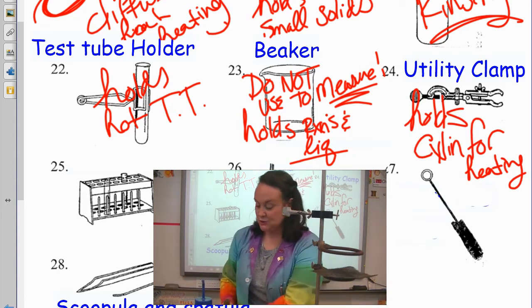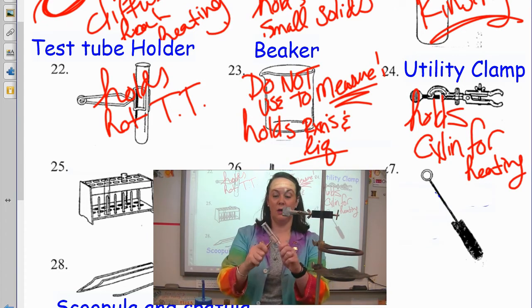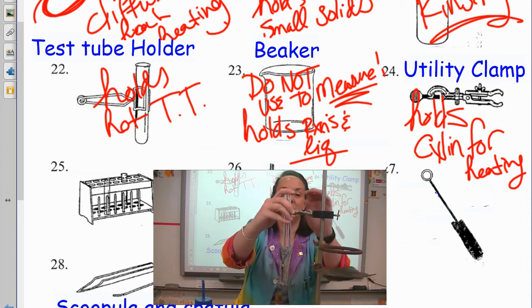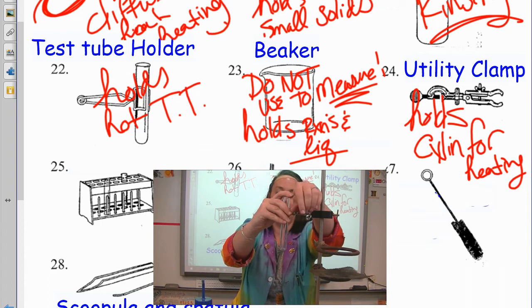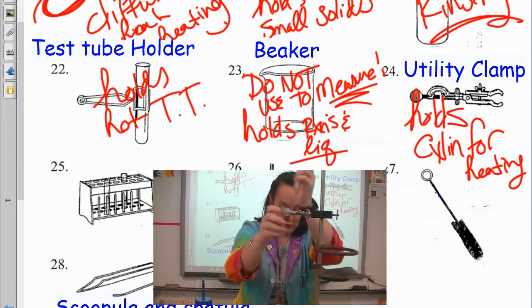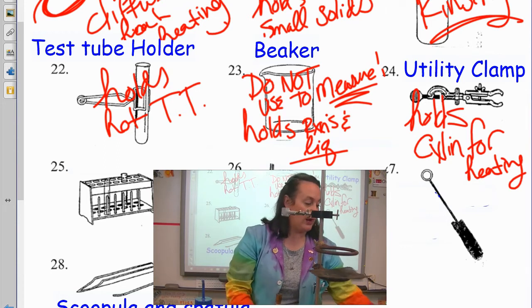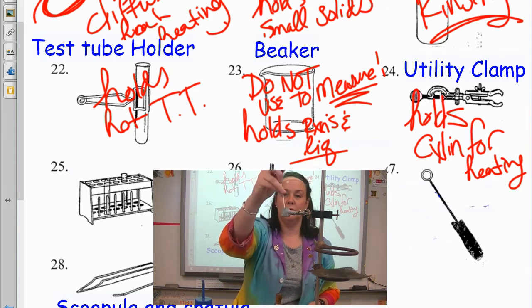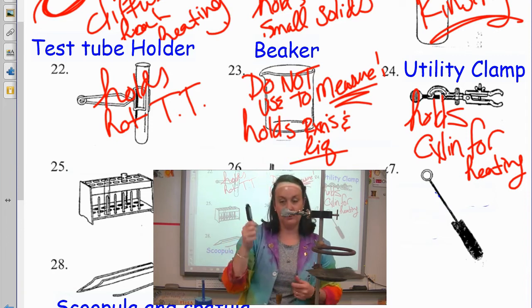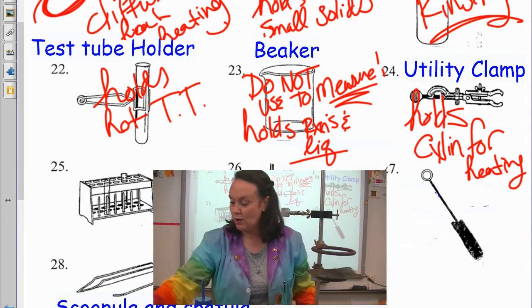So you can take a test tube. If you didn't want to hold it with the test tube holder and you wanted to heat something, you can put the test tube in here, clamp it down, and then now we're heating a test tube without having to get near the heat. You can also use it to hold a thermometer. If we were trying to take the temperature of some water, things like that. So it just holds round things, cylinders, for heating.